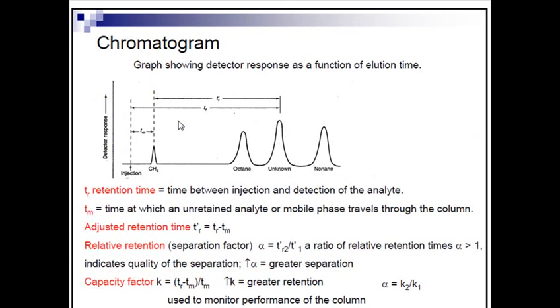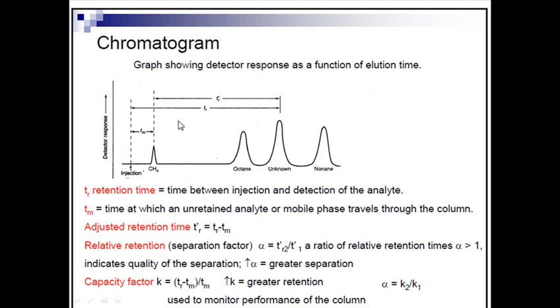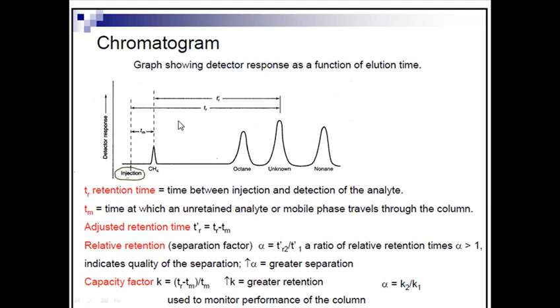That's it. Now let's talk about a chromatogram and what parts it consists of. In this picture, the injection time begins here. The chromatogram starts at the point when the analyte enters the column. It is the injection time, when we add our analytes.